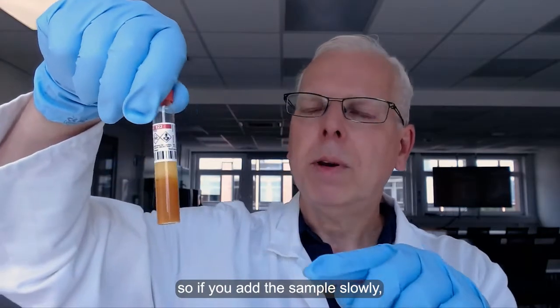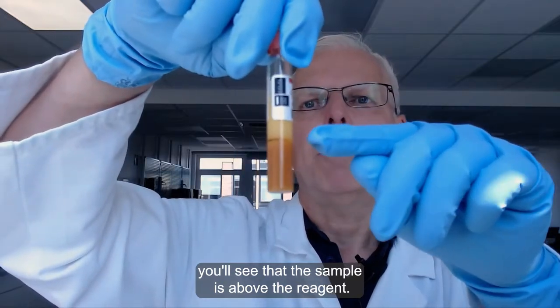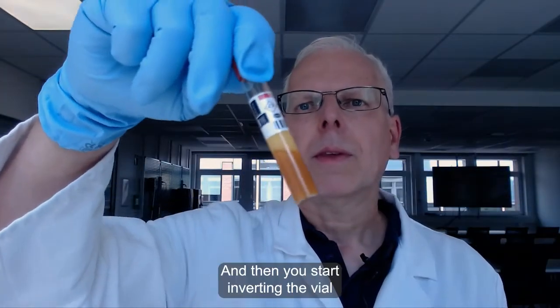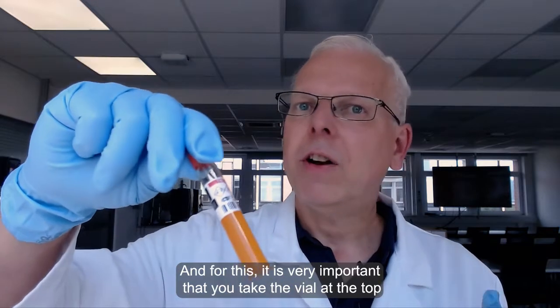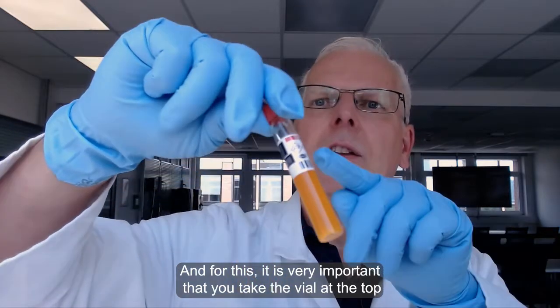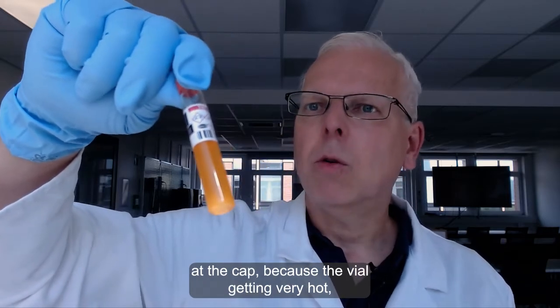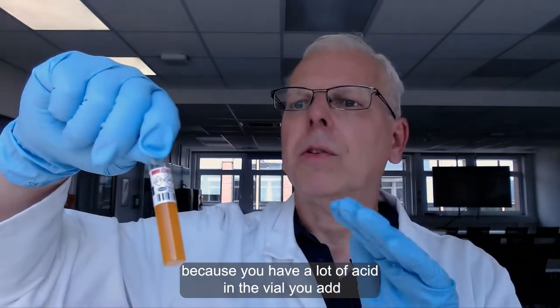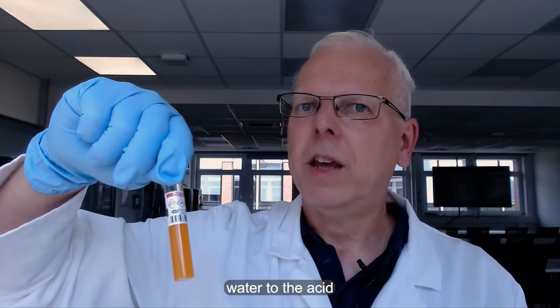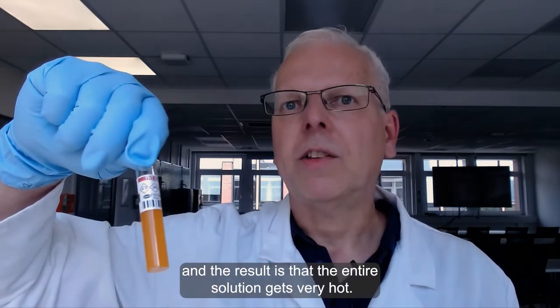If you add the sample slowly, you can see that the sample sits above the reagent, and then you start inverting the vial a couple of times. It is very important that you take the vial at the top, at the cap, because the vial gets very hot. Because you have a lot of acid in the vial, you are adding water to the acid, and the result is that the entire solution gets very hot.